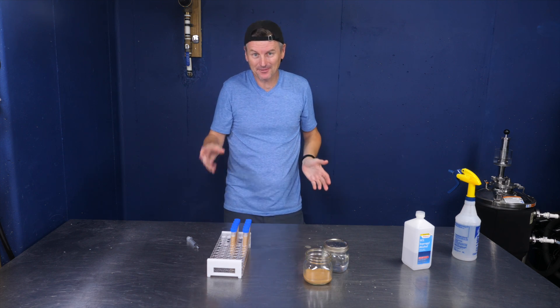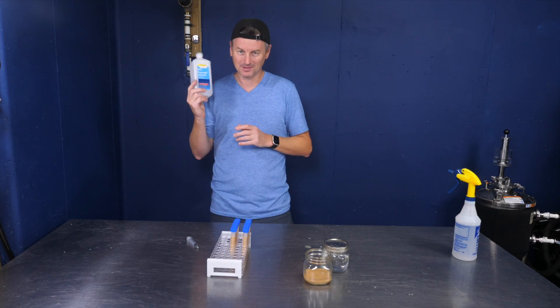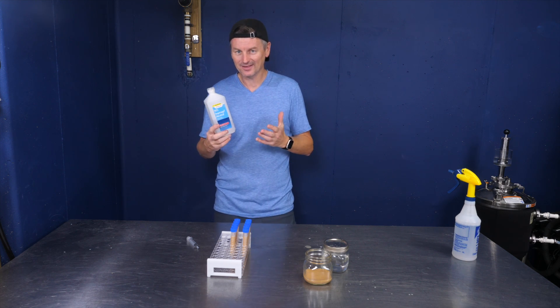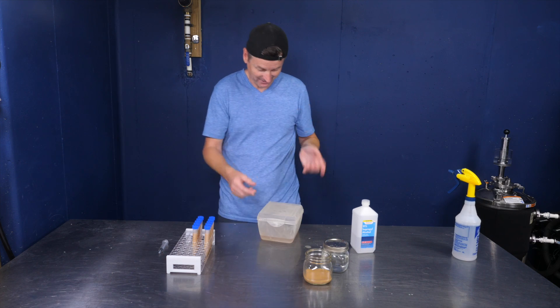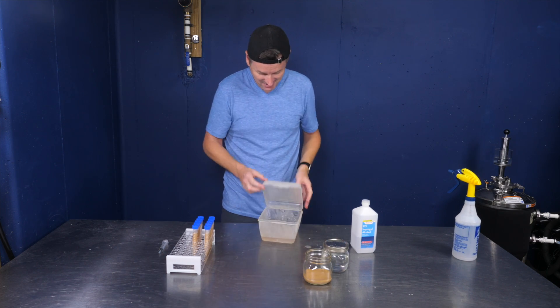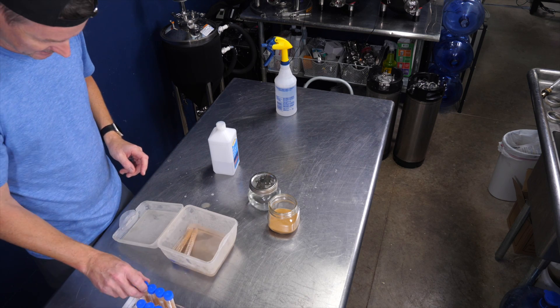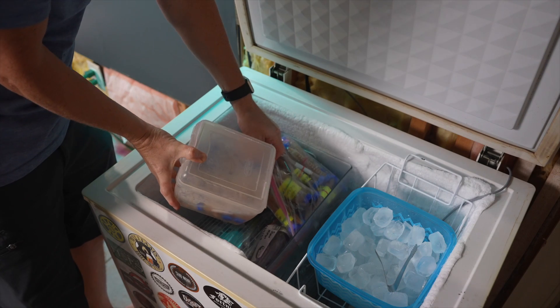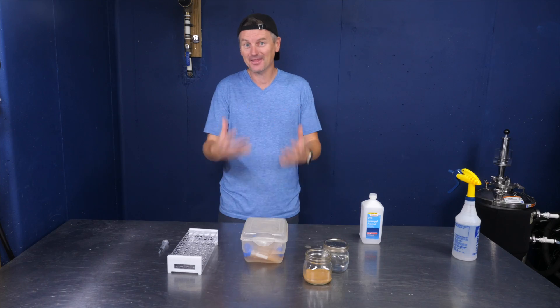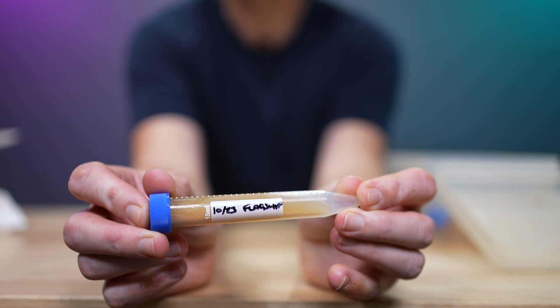I could just throw this in the freezer right now, but there is an extra stage I like to take which will slow down the freezing of the yeast. To do that I'm using my isopropyl alcohol. What I've got here is simply a bit of plastic Tupperware with some isopropyl alcohol already in here — it's already cold because it comes straight out of my freezer. I'm just going to throw these test tubes in here and put this back in my freezer and leave it for about two days. At that point these yeast vials should be frozen. Then I can take them out, label each vial as to what's in there, and just store them in my freezer until I need them.